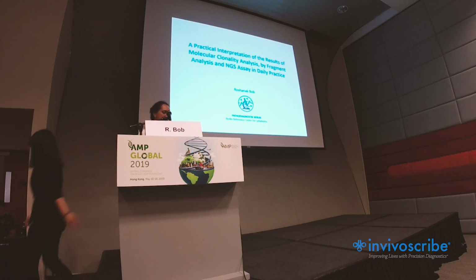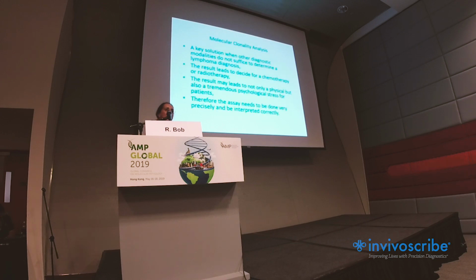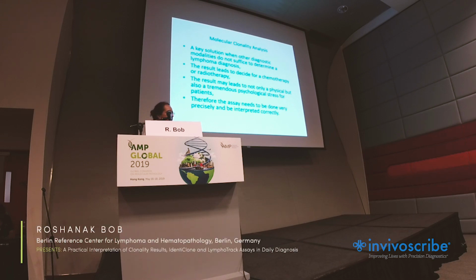My topic is a practical interpretation of the results of molecular clonality analysis by fragment analysis and NGS assay in daily practice. We know that molecular analysis of clonality is a crucial analysis for us as hematopathologists when other diagnostic modalities do not suffice to make the diagnosis of lymphoma.